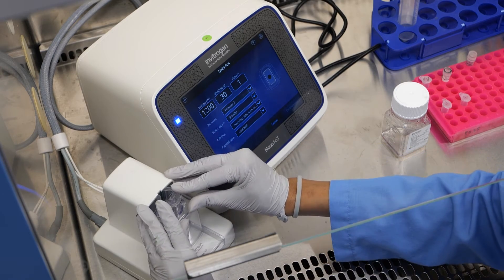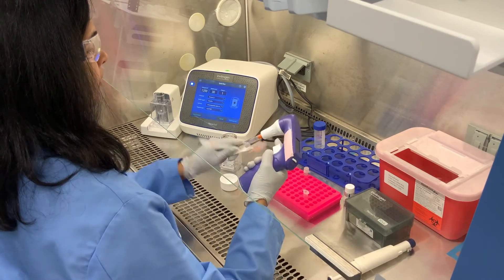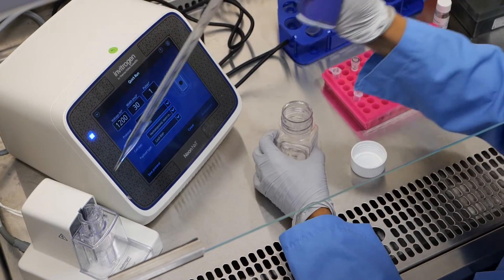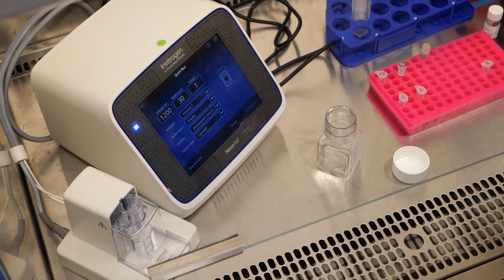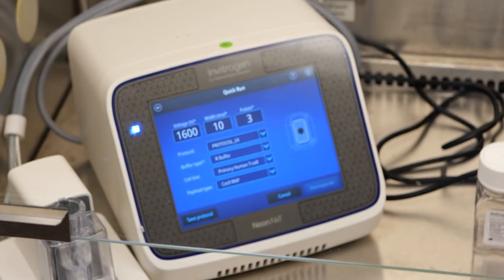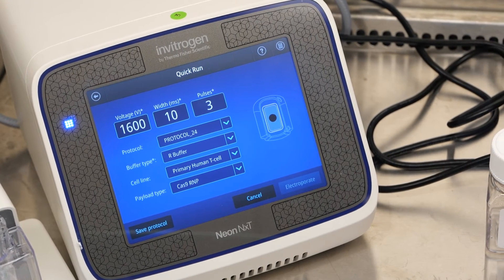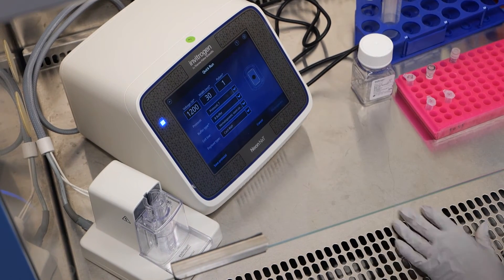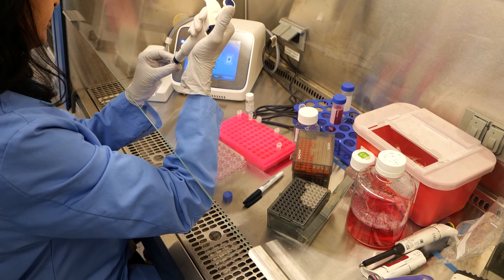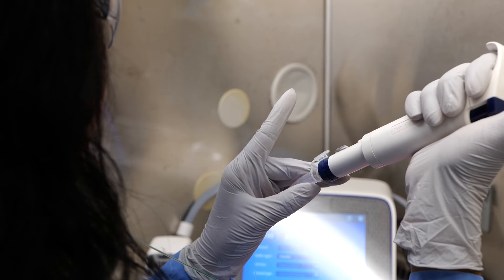The NeonNext electroporation system should now be set up. Add 2 millilitres of electrolytic buffer to the sterile NeonNext tube and insert it into the pipette station. Load your experiment from Thermo Fisher Transfection Lab or use the quick run function. For T-cells, we recommend using 1600 volts, 10 milliseconds, and 3 pulses. Using the NeonNext pipette and 10 µL NeonNext tips, gently mix your cell and RNP complex mixture. Load the tip by pipetting slowly to help prevent bubbles from forming. Check the tip carefully for any bubbles.